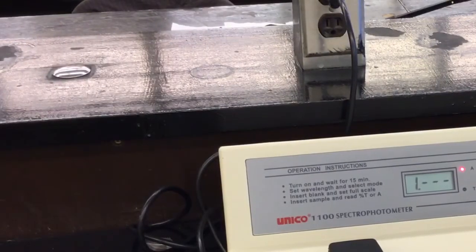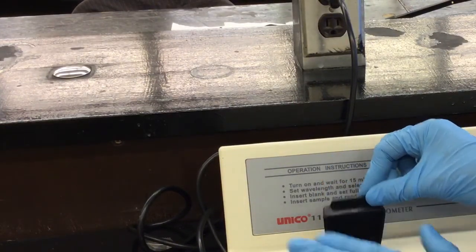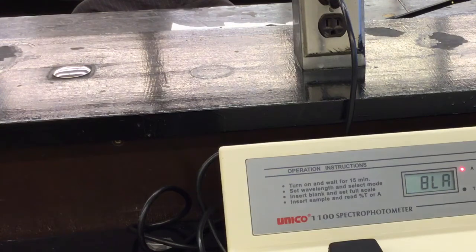I'll put the reagent blank in the spec machine and zero it, so that it zeroes out everything in that solution. In the other spec tubes, the machine will only read the absorbance of the redox dye, because that's the difference — the reagent blank has everything except the redox dye. You zero the reagent blank in between samples to isolate the redox dye absorbance.